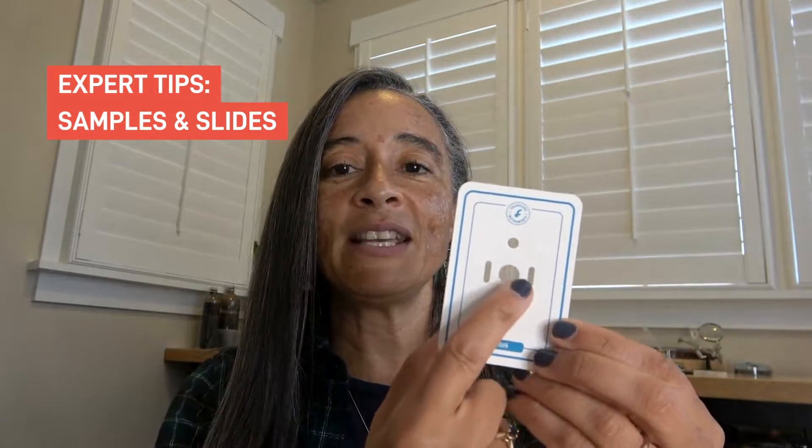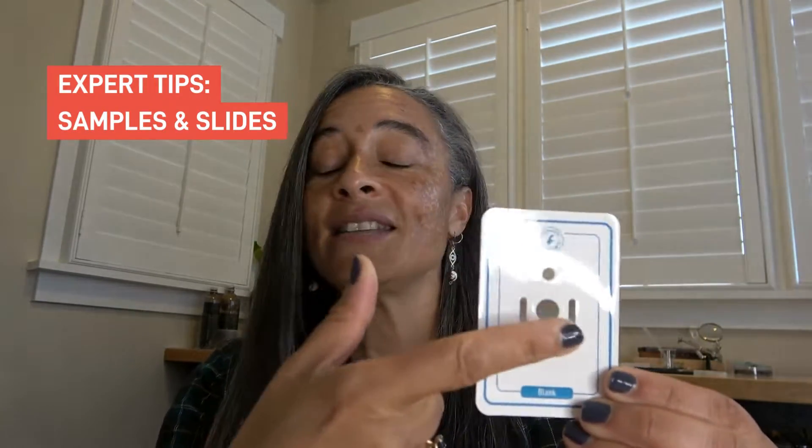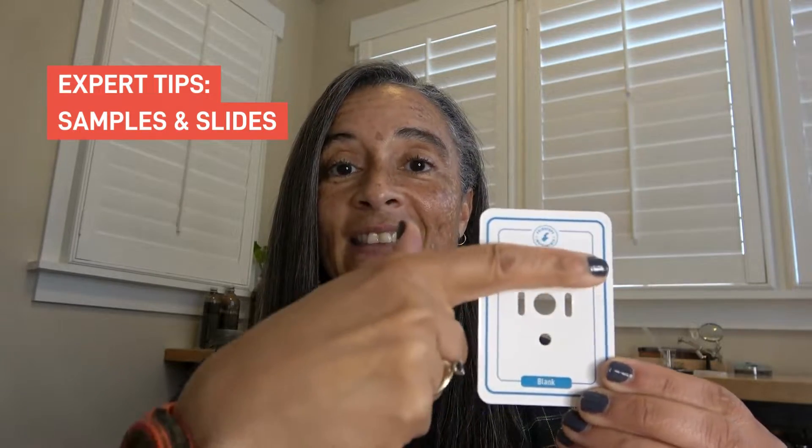There's also our new trading cards. You can put your dry sample in the center of your trading card by placing a clear sticker on the back, placing your sample on the front, and then sealing it to the trading card with another clear sticker.